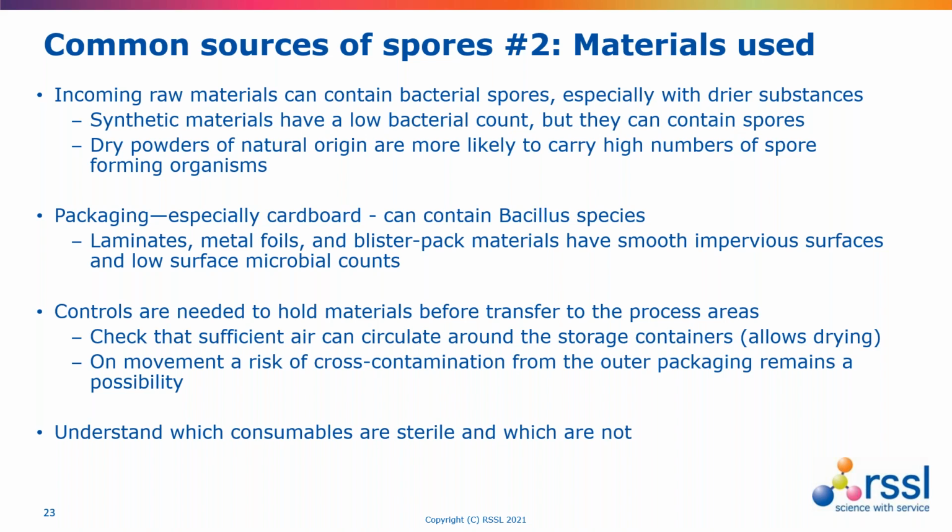Between these different substances, synthetic materials tend to have a relatively low bacterial count, but of course they can contain spores under some circumstances. Dry powders that are derived from materials of natural origin are more likely to carry higher numbers of spore-forming organisms. So this makes testing important, and purchasing materials from an approved supplier important as well.